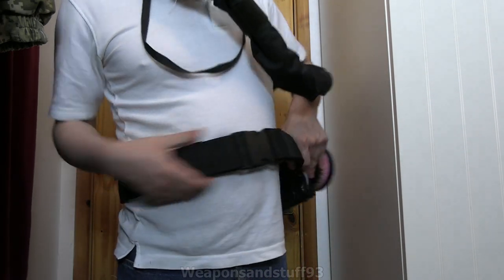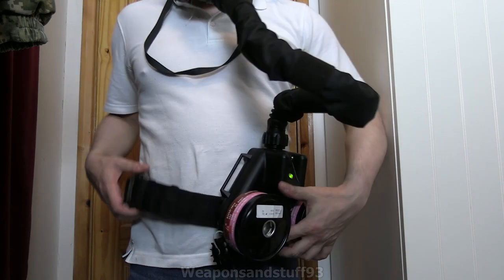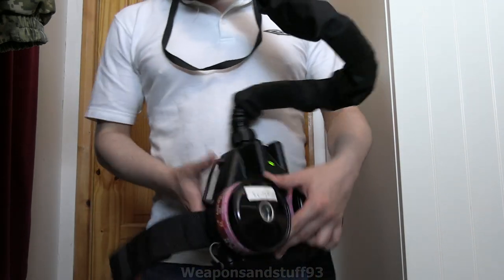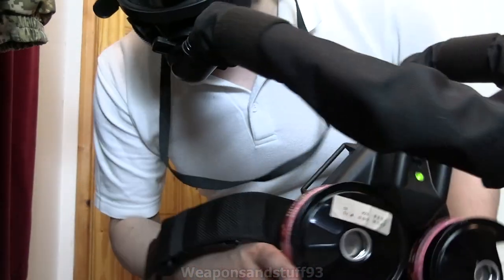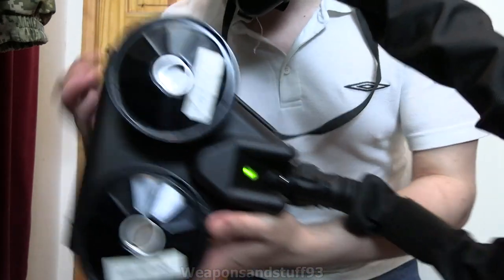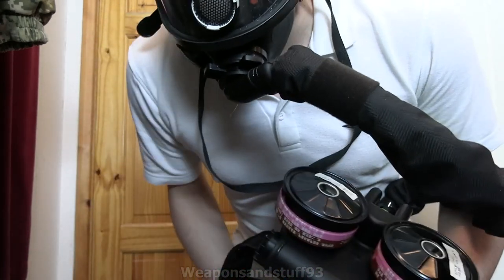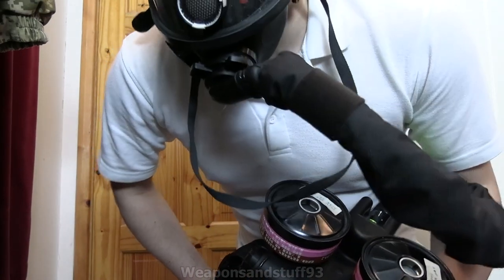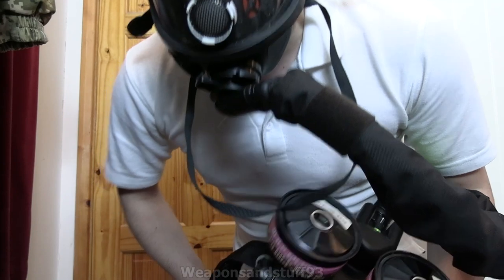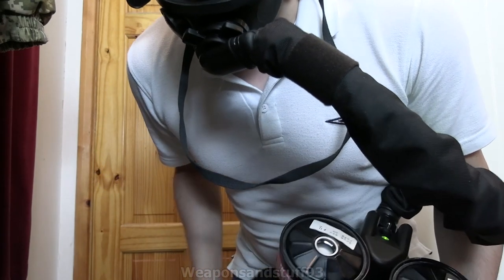I can certainly see from using this why it's held in such high regard by a lot of people. It's simply because it's not too heavy, not too bulky — the layout is quite triangular but not too bulky in any direction — and it provides a good amount of airflow without being too loud. So that's probably why it's the gold standard.